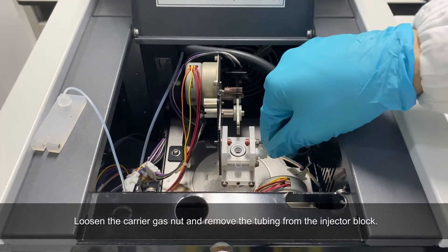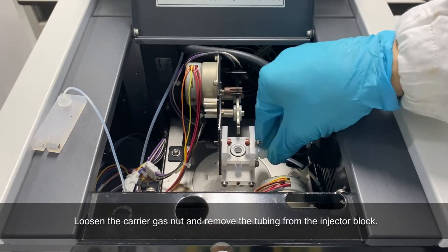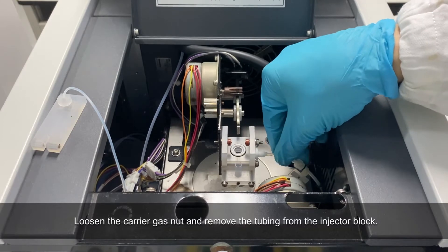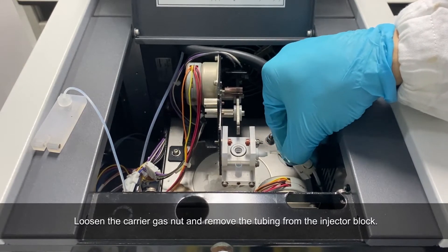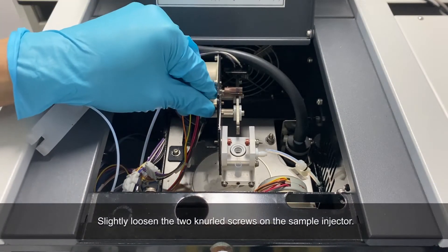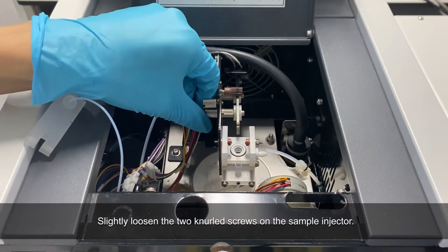Loosen the carrier gas nut and remove the tubing from the injector block. Slightly loosen the two screws on the sample injector.